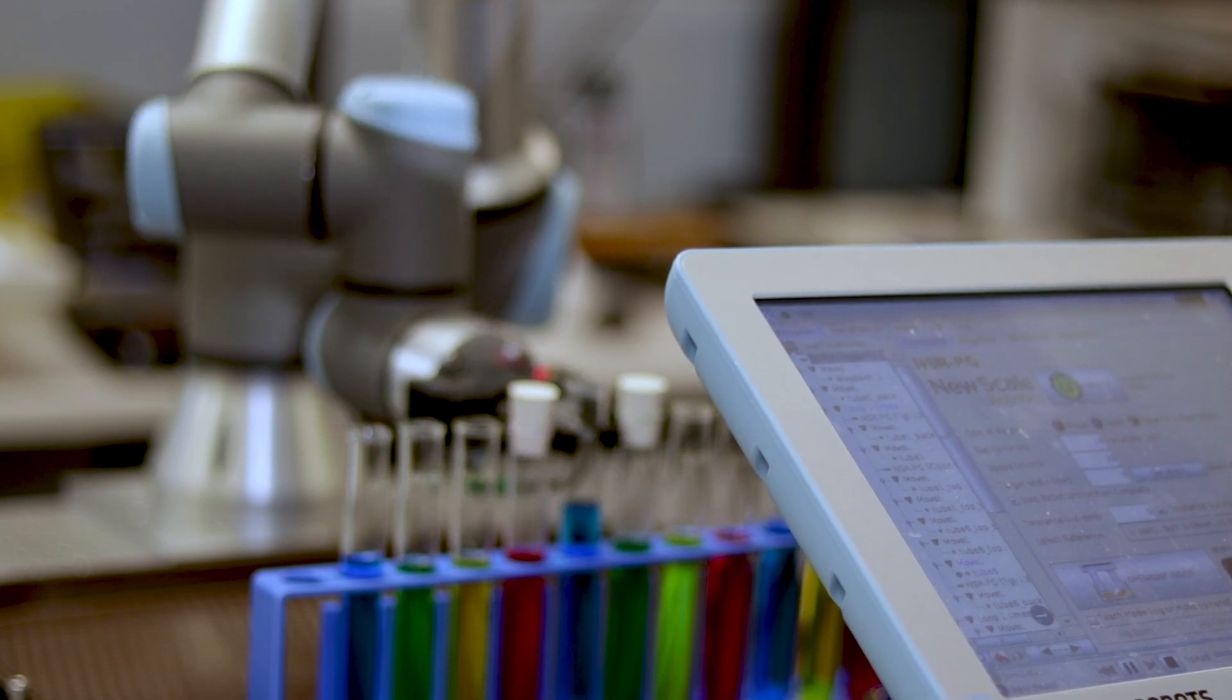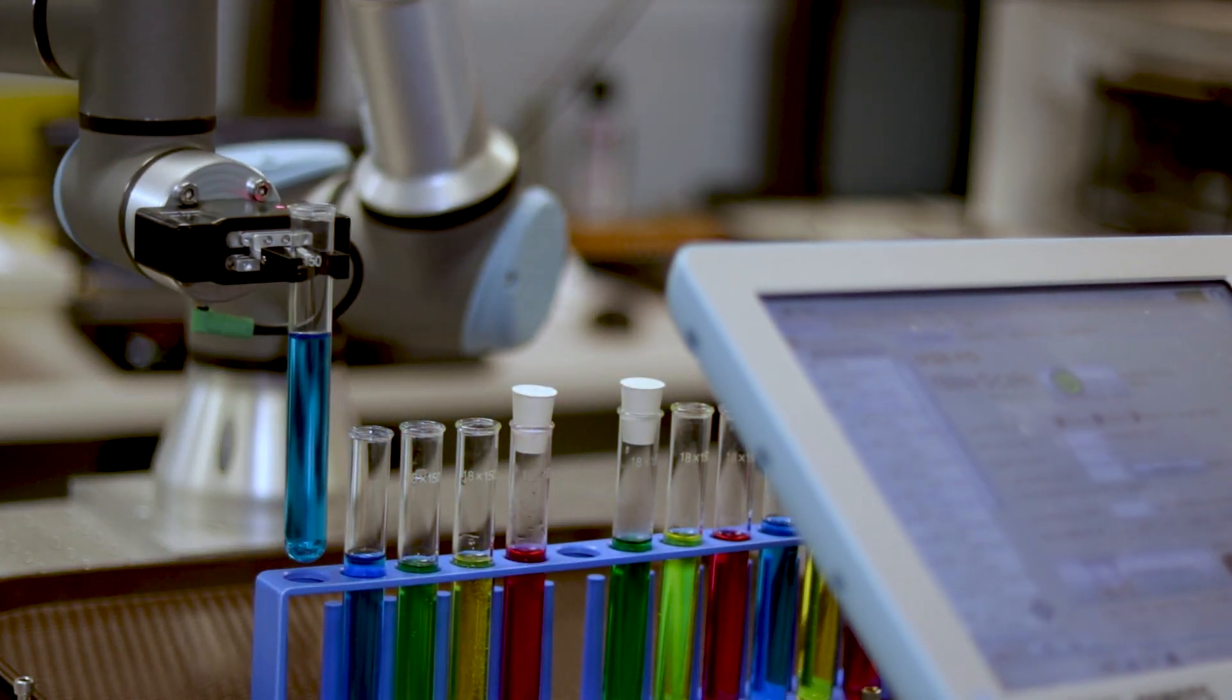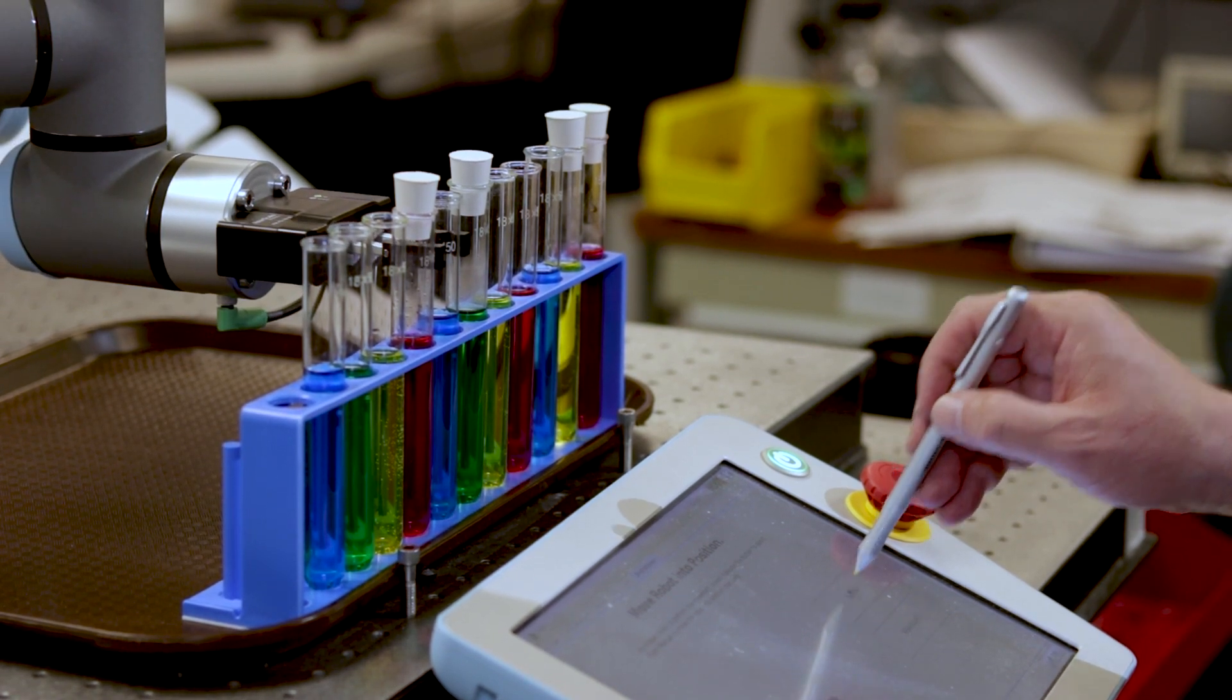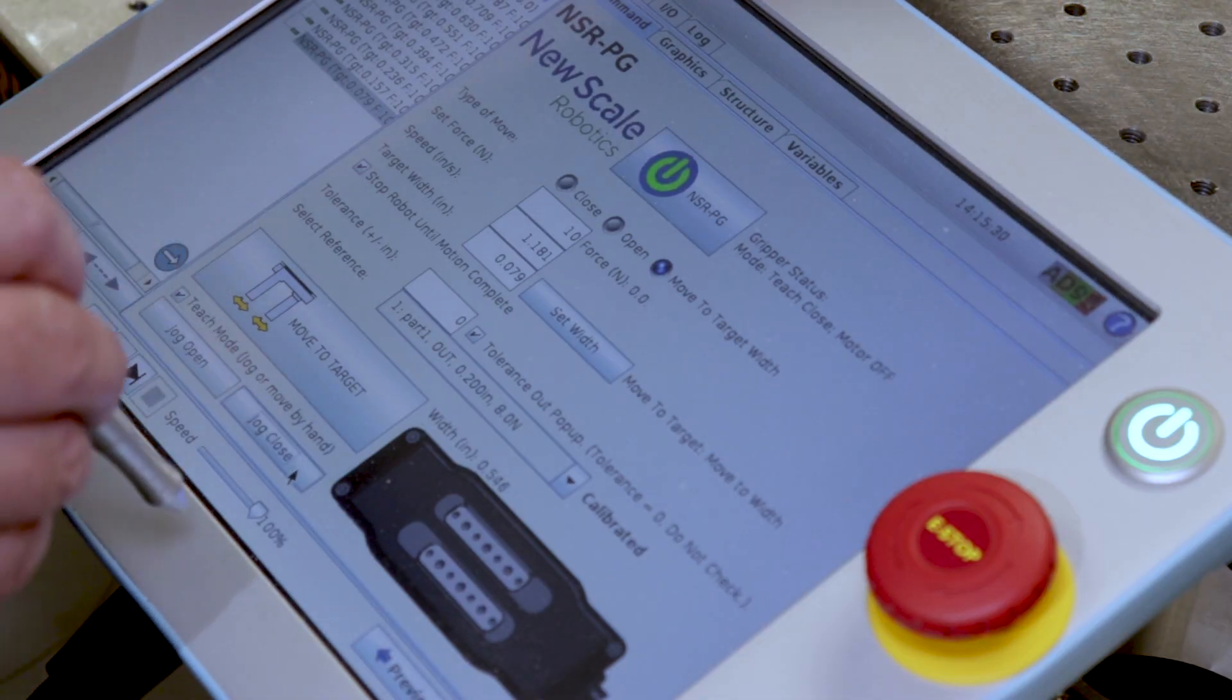Teaching and working with your NSRPG is simple and intuitive. Anyone in your organization can teach the robot what to do using our user interface designed for the UR Teach Pendant.